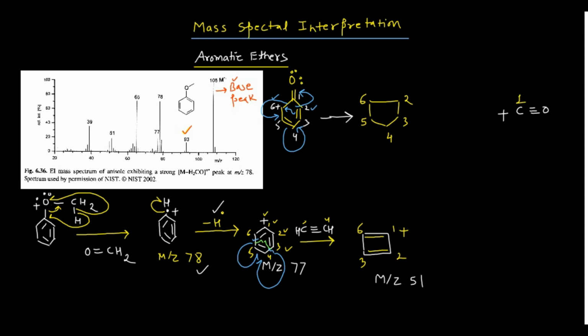And now you can check the positions of the double bond. Now this electron pair is shifted from here to here. That means the new bond is in between carbon 3 and carbon 4. So you can straightforwardly put this particular bond here, carbon 3 and carbon 4, and then this has shifted from here to here. That means carbon 5 and carbon 6 will also have a double bond. So I can draw this double bond here as well.